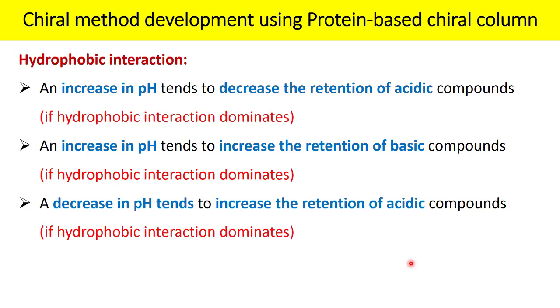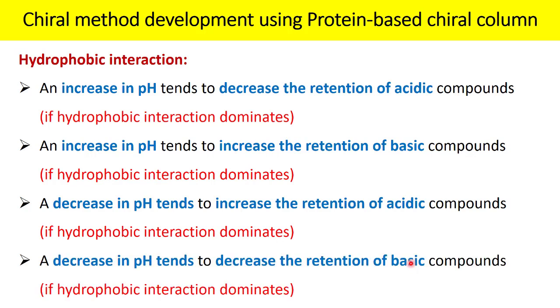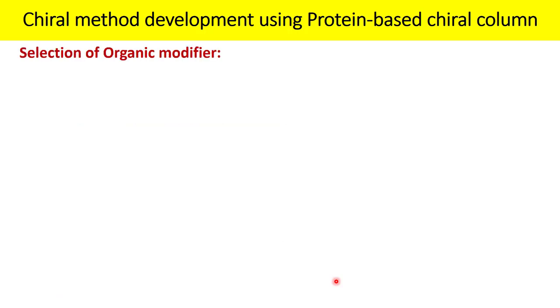So whether there will be great hydrophobic interaction possible now? Certainly yes. So at the lower pH, acidic compound will have the increased retention time. And last but not the least, a decrease in pH tends to decrease the retention time of basic compound. I hope you will be able to analyze yourself and tell me the answer in the chat box.